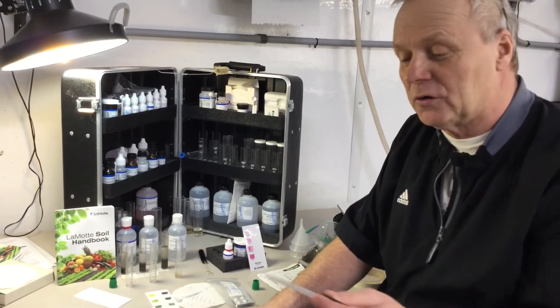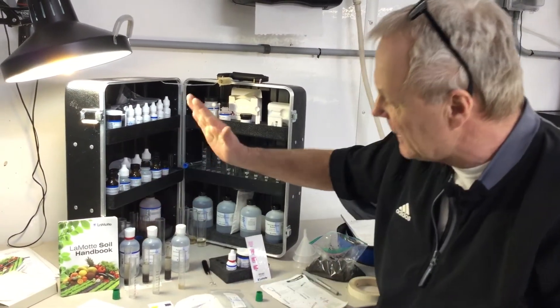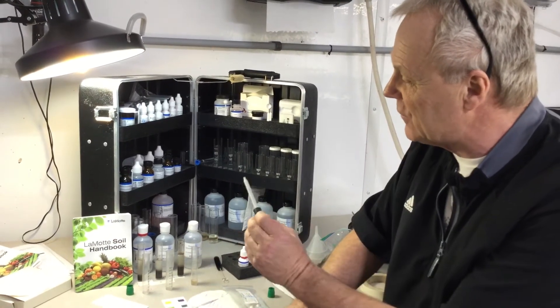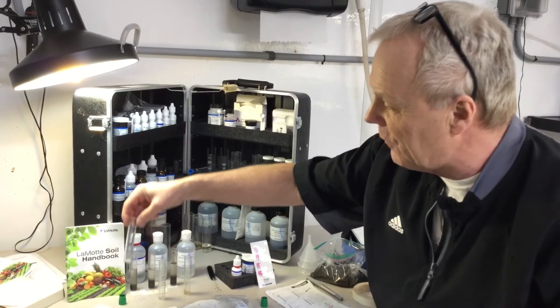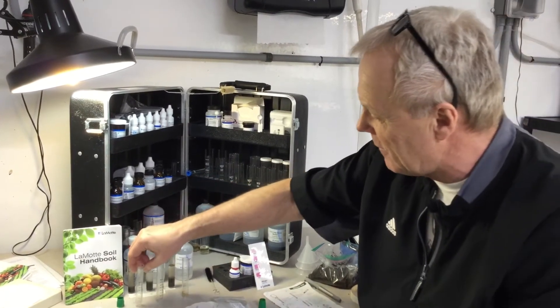Now what we're going to do is go into those and extract the clear liquid. You can see how they've settled — that's what we waited for. Once that settles down to the bottom, we're going to extract out of those test tubes and fill into here. We've got to get to line three for the nitrogen and the phosphorus, each one of them.